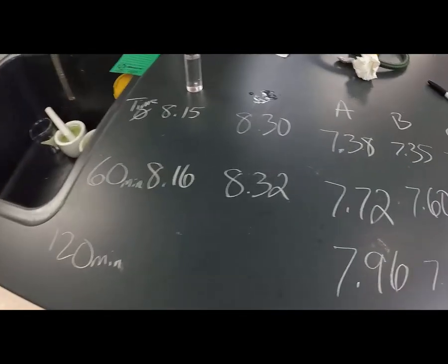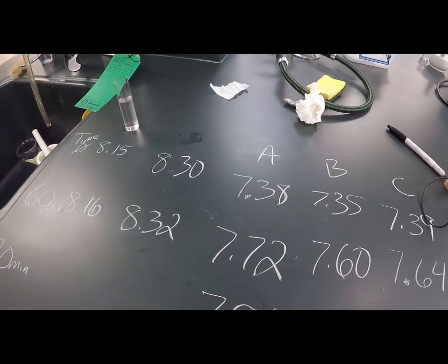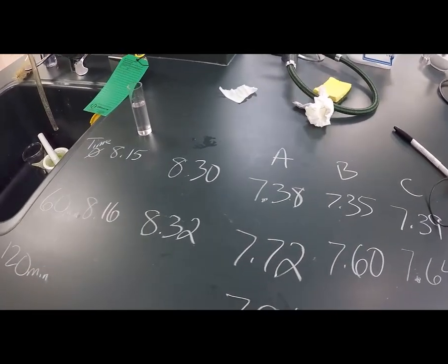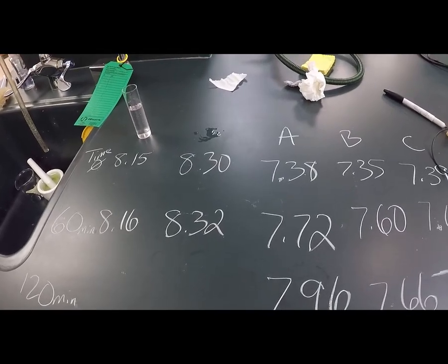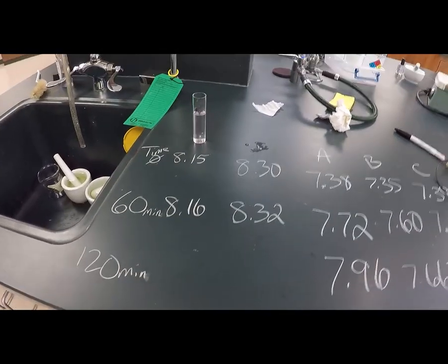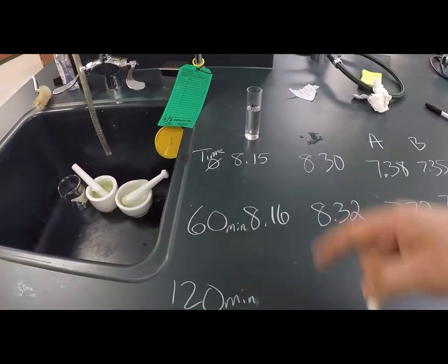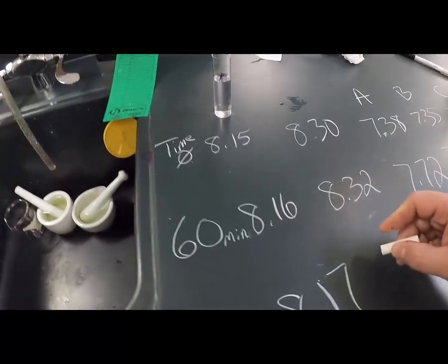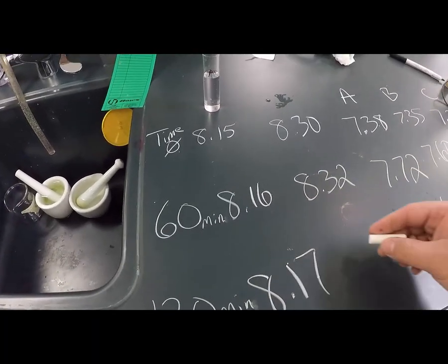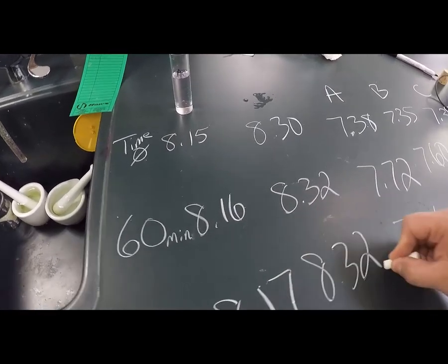Remember, it stopped at 8.32. I'm guessing it's going to be about 8.32 given the rate that it's going down. So I'm going to stop the video there, and you can tell here are the numbers. These are basically the same, 16, 17. I already did this one, and then we'll just call this the same as the last time.